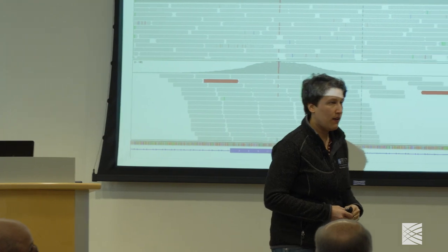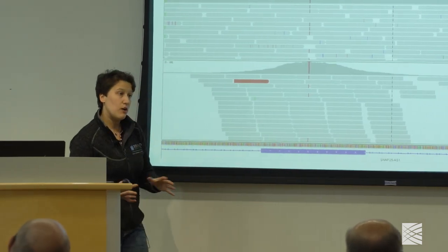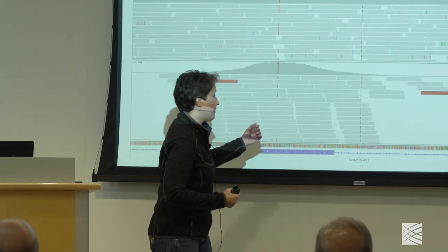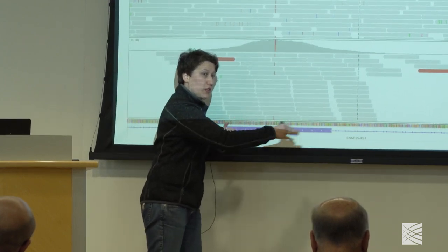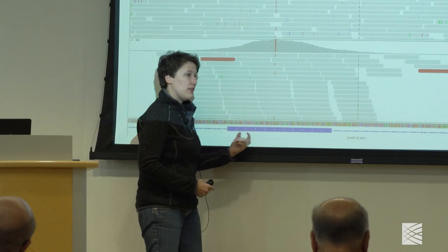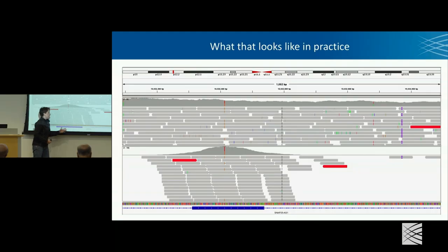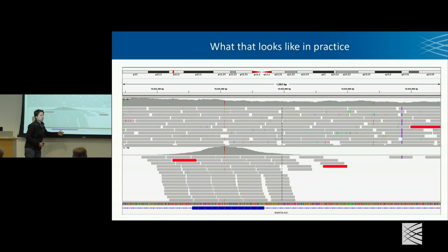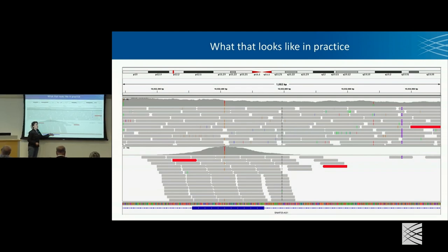Typically, how far past the end of an exon do these reads extend? So how far do the reads extend? It depends a lot on the design of the baits that are going to capture reads, because basically you have all the reads, and then you're capturing a subset of the reads and washing out the others. The ones you capture depend on how the baits, which are little oligos really, are designed. Typically it's, I would say, 100 base pairs on either side. But that varies a lot, also because people use different annotations in some cases as a basis. That's why you can sometimes have important differences in the amount of coverage that you get for certain exons. Okay? All right.